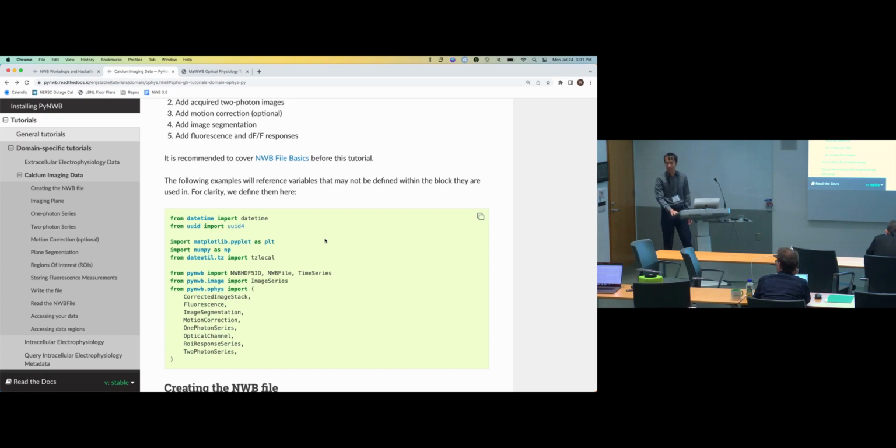The solution to that was that we provide a custom column. They define, okay, for all your ROIs, a given set, those map onto a global ID.